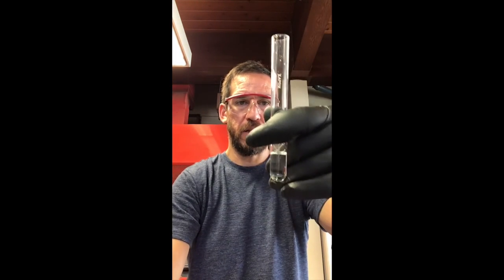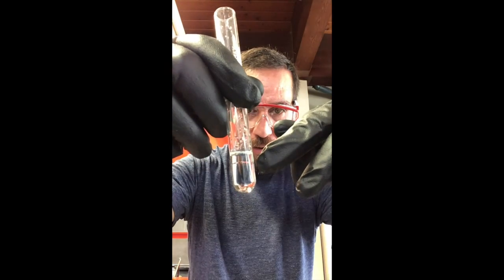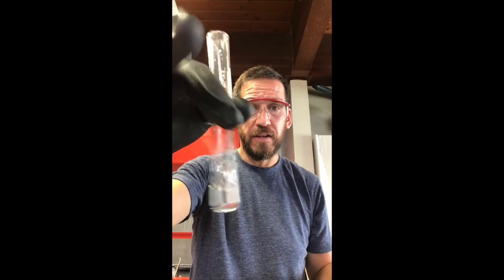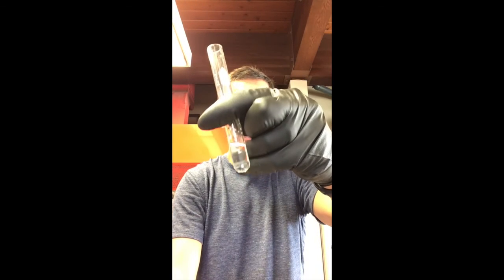And let's take a look more closely. Where is that layer building? It is right here. Oh, you can see it there now, right? Right there. That's the small layer, right? The small layer is the small amount of number 2 that I've just added. Let's give it a little shake to see if it falls to the bottom. Okay, well, it doesn't. It's staying at the top. So what does that mean? Let's add a little bit more just for funsies.